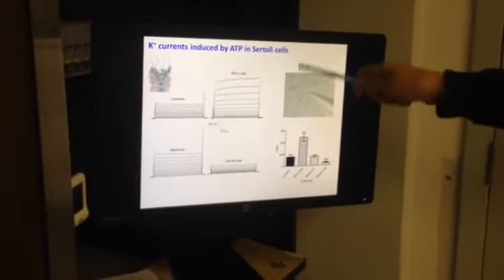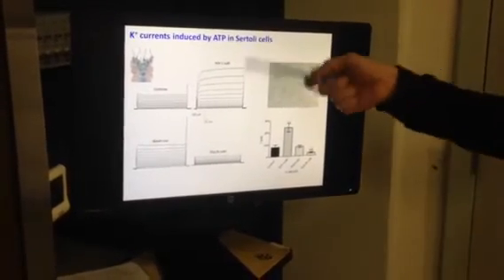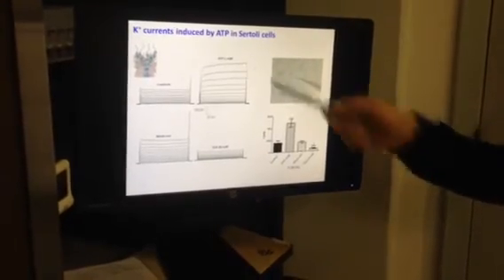So this is very nice because this professor, this student actually, she's a PhD student, she's showing that ATP is very toxic for the cells and activates a lot of kinds of oxidative stress and things like that. So this is another project we're running in the lab.